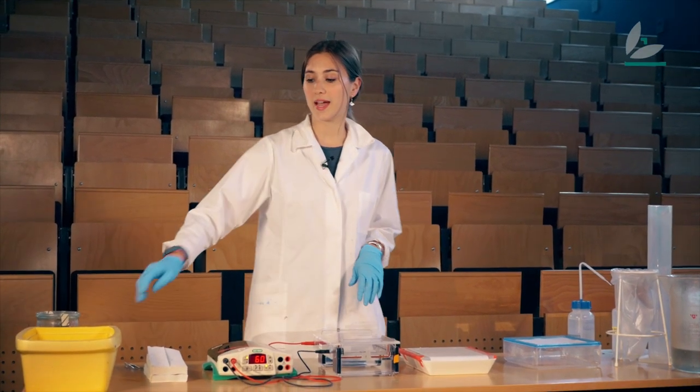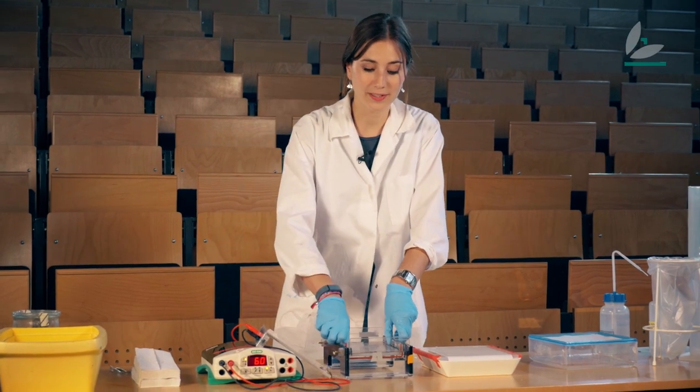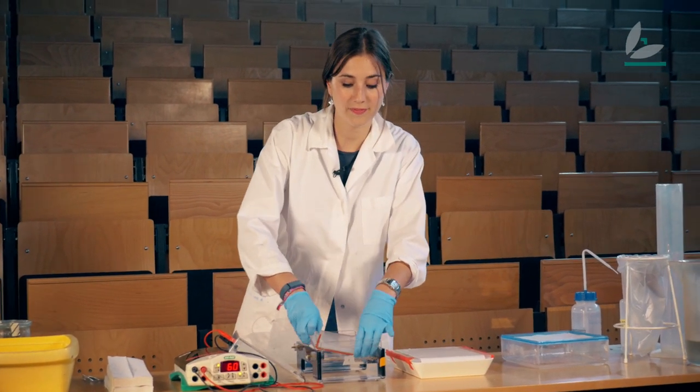So I have to separate the RNA molecules by their size with gel electrophoresis. I've already explained how gel electrophoresis works in a previous video called gel electrophoresis. So that's what I've done here already and the RNA molecules are separated after size.